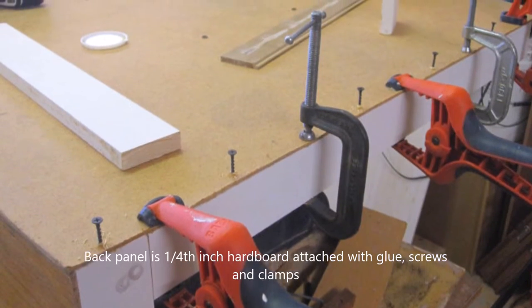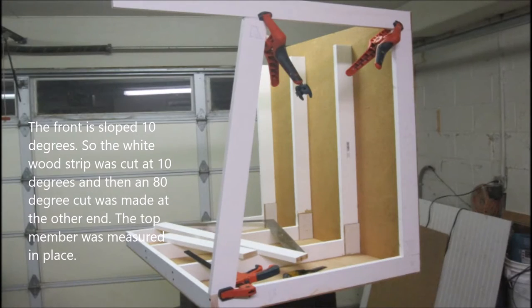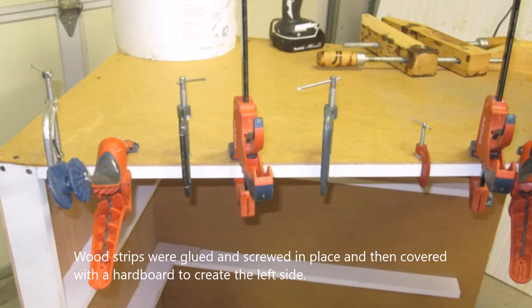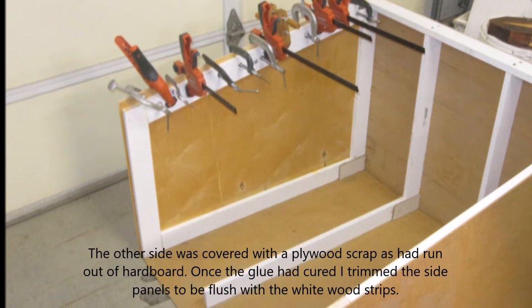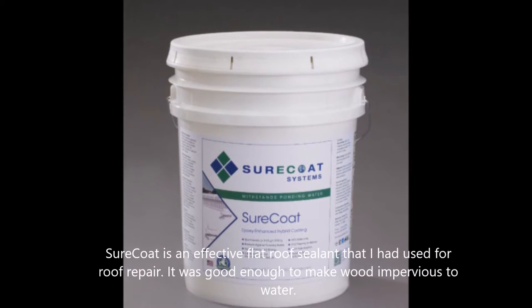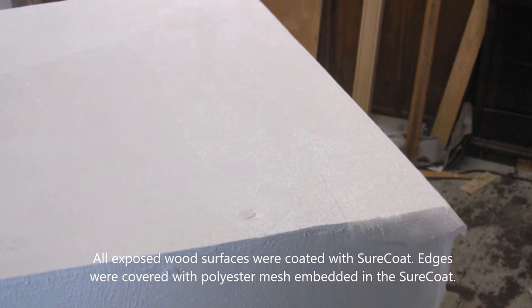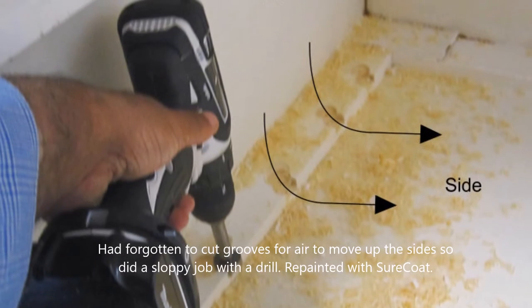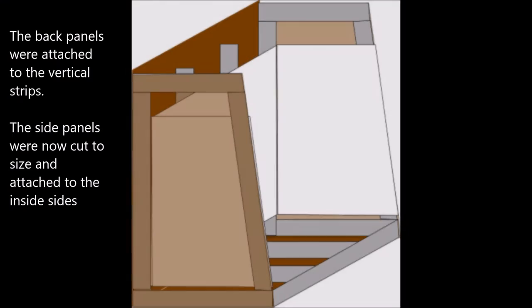I wasn't too worried about using wood. The front panel slopes around 10 degrees inward, so I cut the strips at a 10-degree angle, then added left and right side panels out of plywood. I wasn't worried about wood because I have this almost magical material called SureCoat, which makes wood essentially impervious to water. The edges were covered with polyester mesh plus another coat of it.